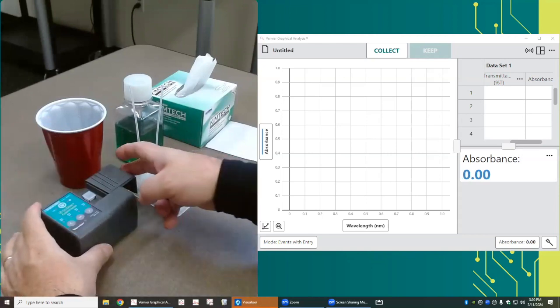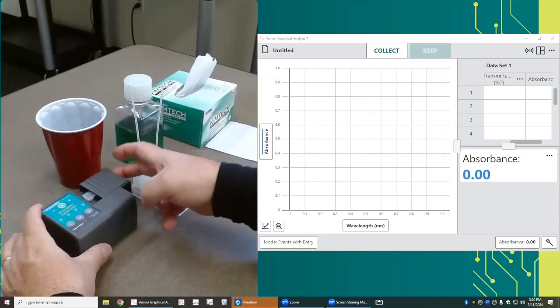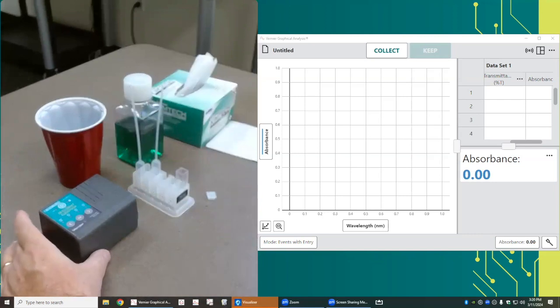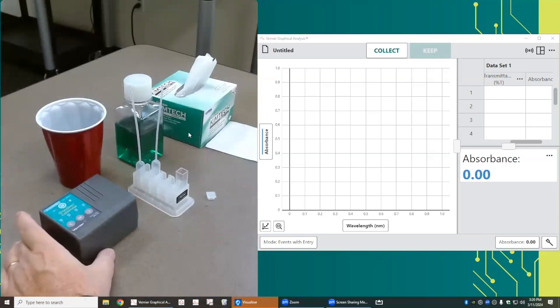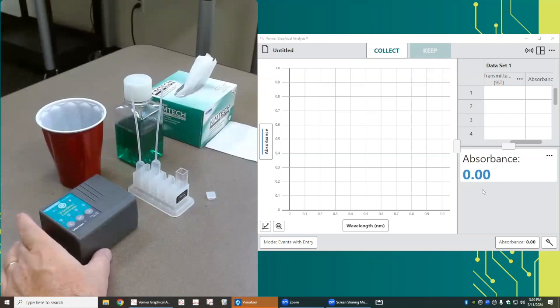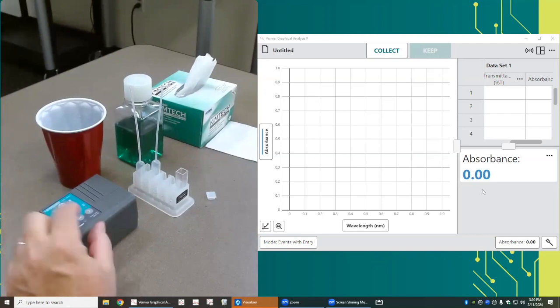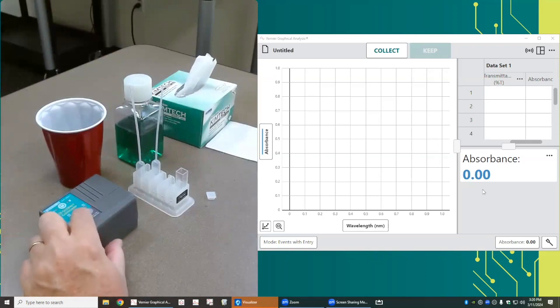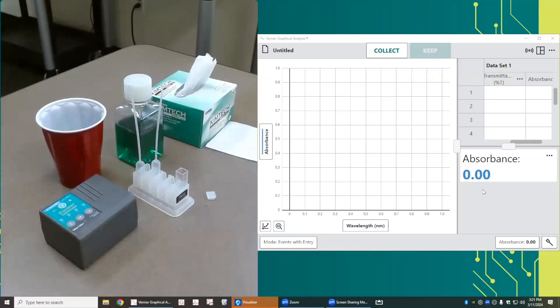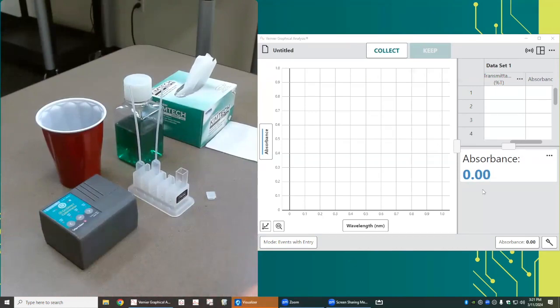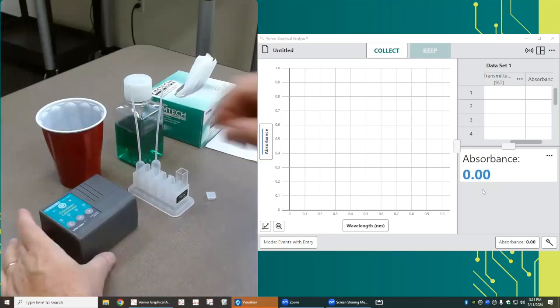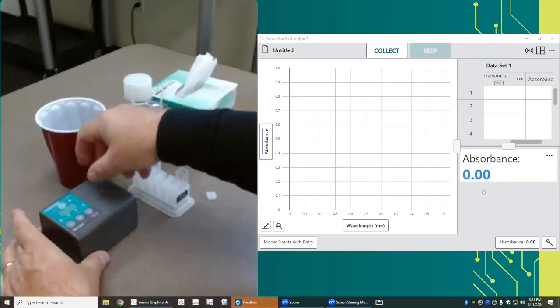I'm going to close the door on the cuvette, and then I'm going to observe the absorbance reading here. We want that reading to be zero. Should that reading not be zero, right there on the colorimeter there's a button that says howl. I'm going to push that, and what that's going to do is adjust the software and the electronics to measure the maximum amount of light passing through the water. And the absorbance should be zero at that wavelength.